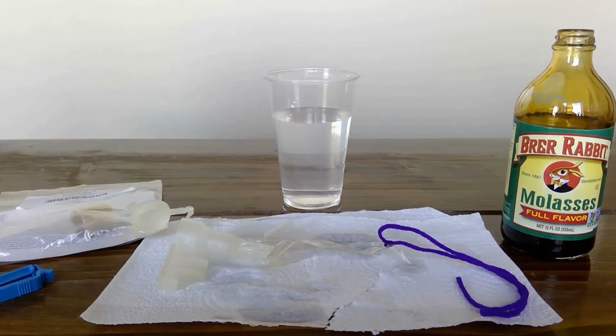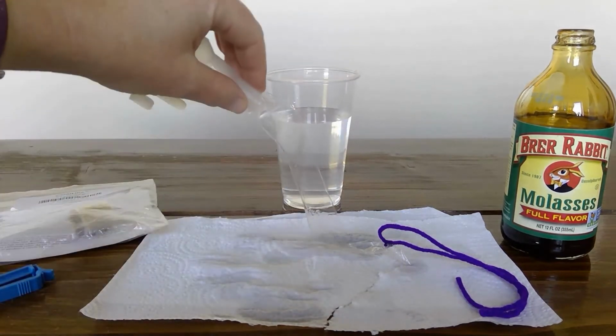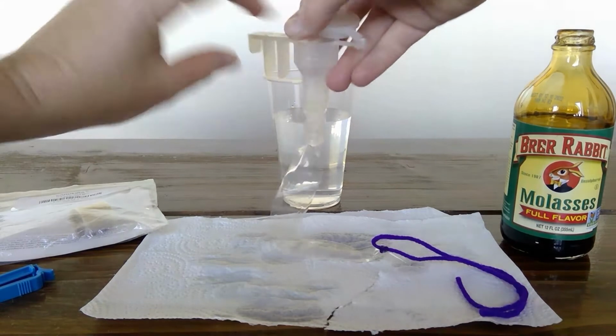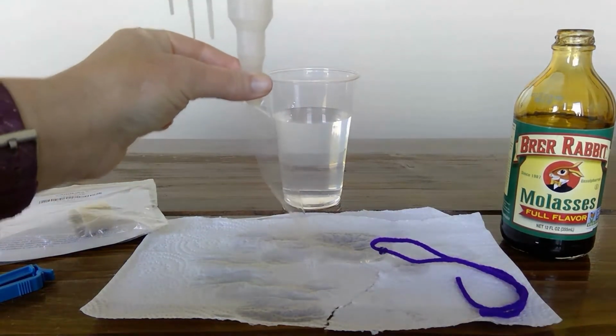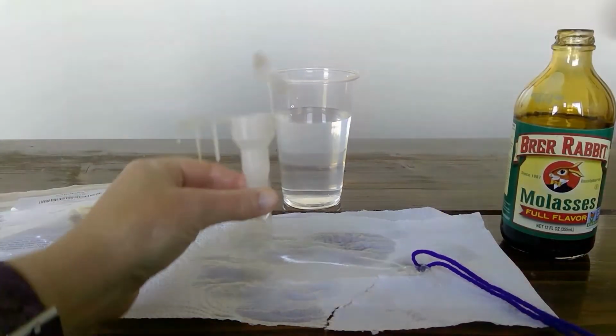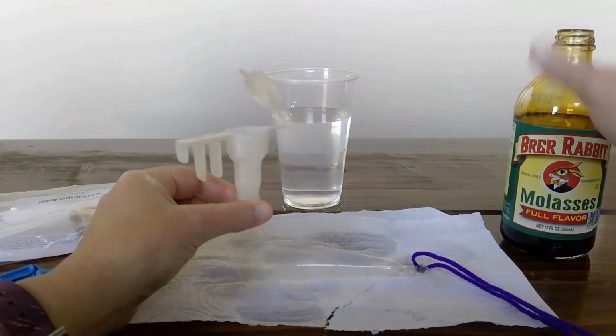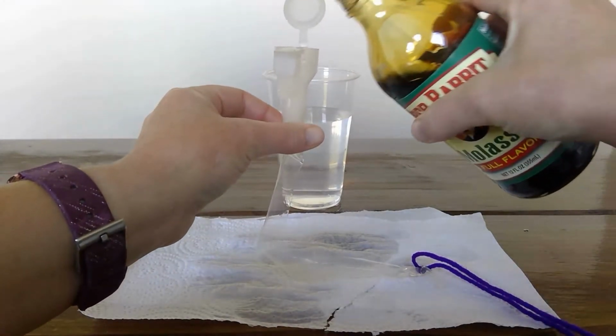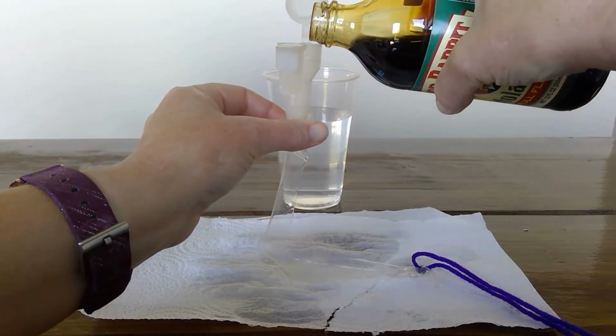The molasses experiment is very similar to the starch experiment. So I again have some dialysis tubing. I've opened it up and I've inserted the funnel, and I'm short a clip, so I put some string onto the bottom of it. So that part of the setup is the same. The difference now is that instead of putting starch water in, we're going to put molasses in.